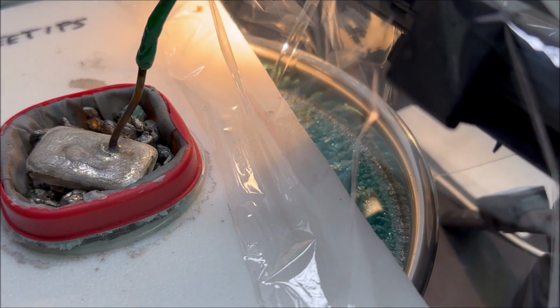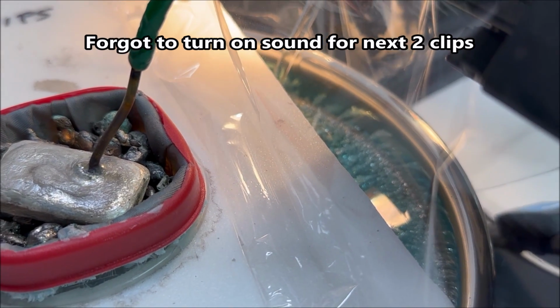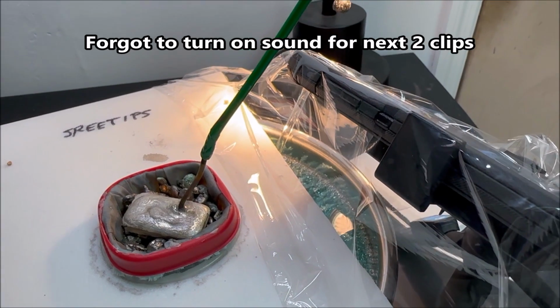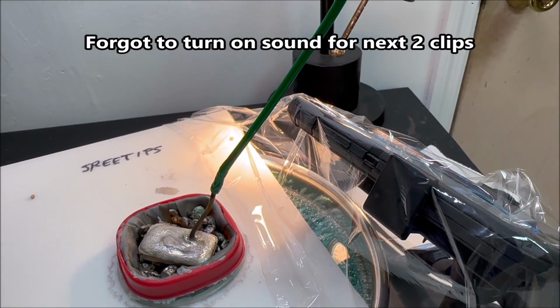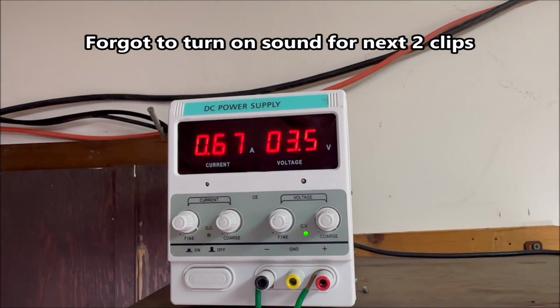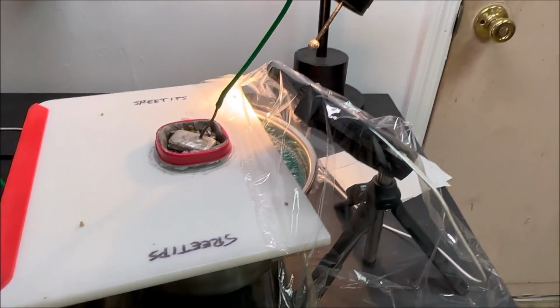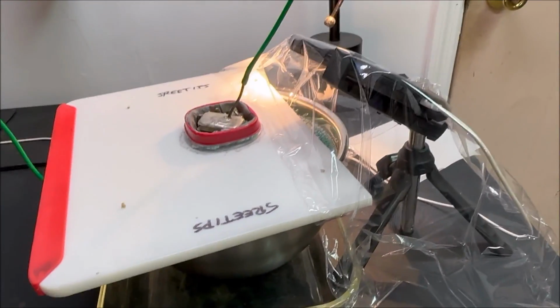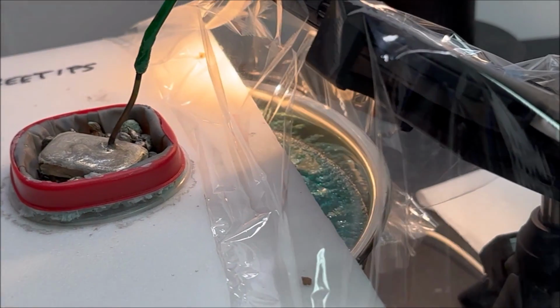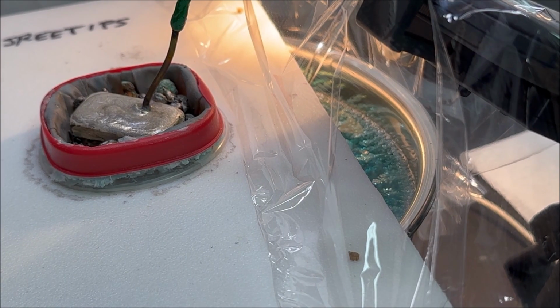Here's a look at the silver cell. The electrolyte level is getting a little bit low again in this thing. The electrolyte level has to be monitored. And what we want to do is add a little bit of silver nitrate solution to this, because the silver cell does become depleted of silver. The electrolyte does anyway. As the cell operates, it plates out on the cathode.